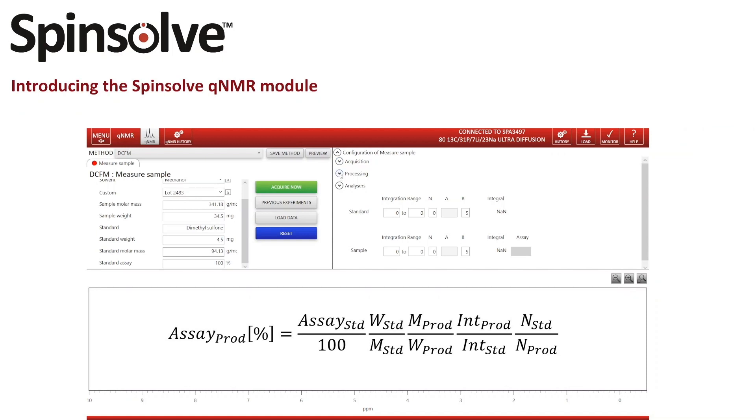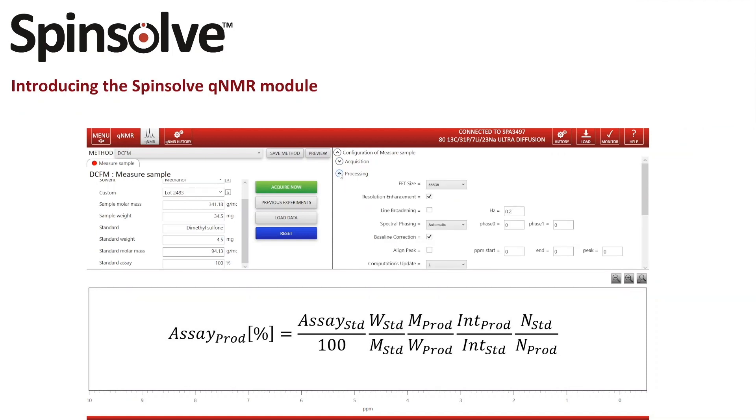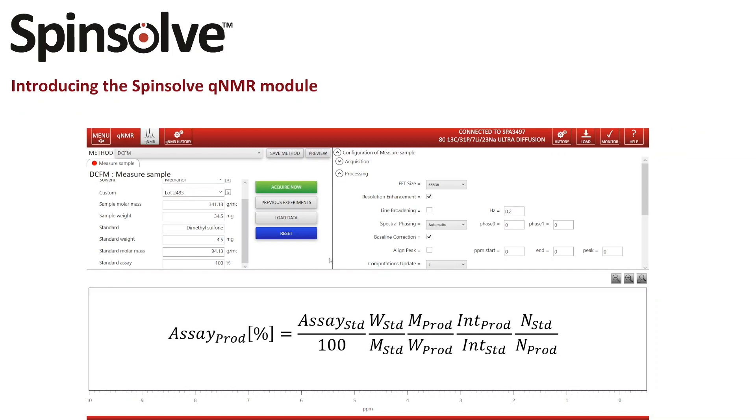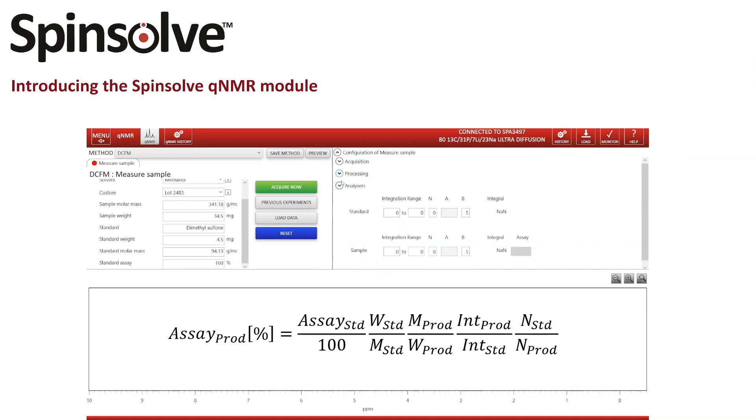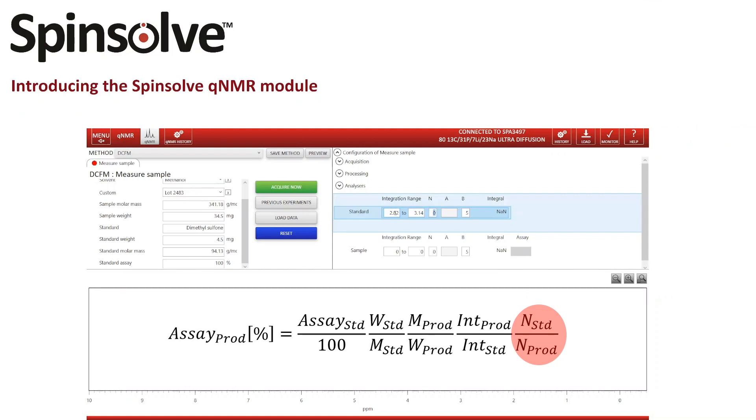For processing I have all the options which you usually have for an NMR experiment such as zero filling, apodization, phasing, baseline correction, and alignment of the spectrum. Finally I need to define the integral regions and the number of nuclei. I also have the option to align the integral and to activate a linear bias and slope correction for my integrals.